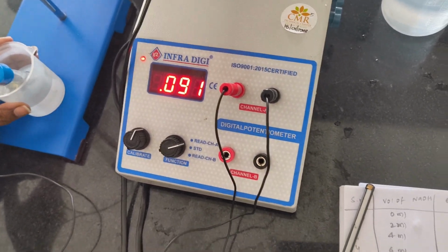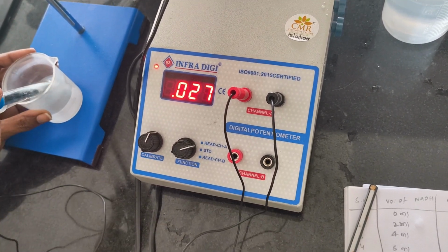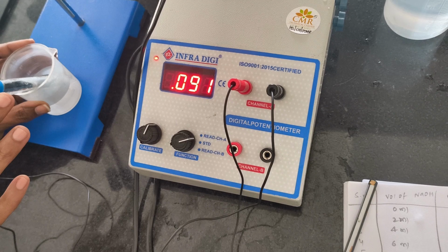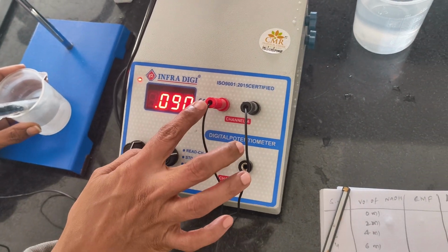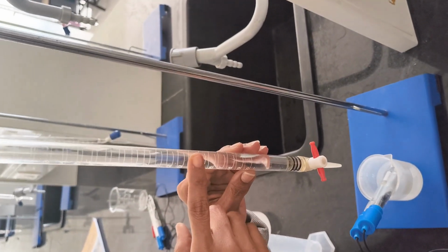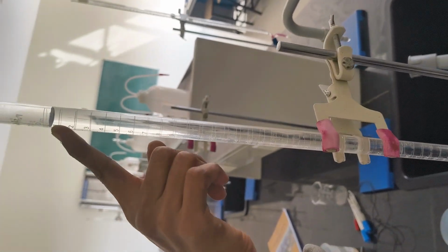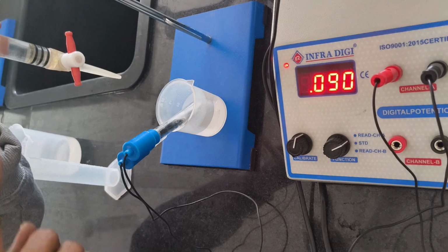After placing the two electrodes into the HCl solution, we have to note down the initial EMF reading from the potentiometer. EMF means electromotive force. Into the burette we have to fill NaOH up to the mark, up to 0, with standard NaOH solution.